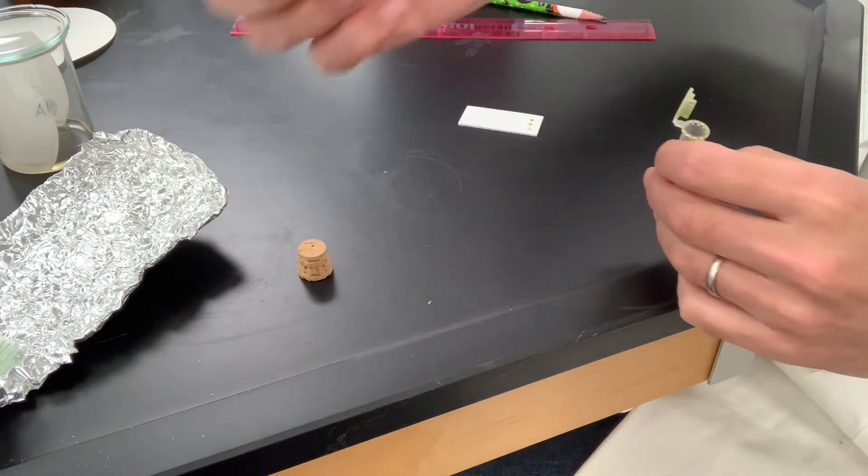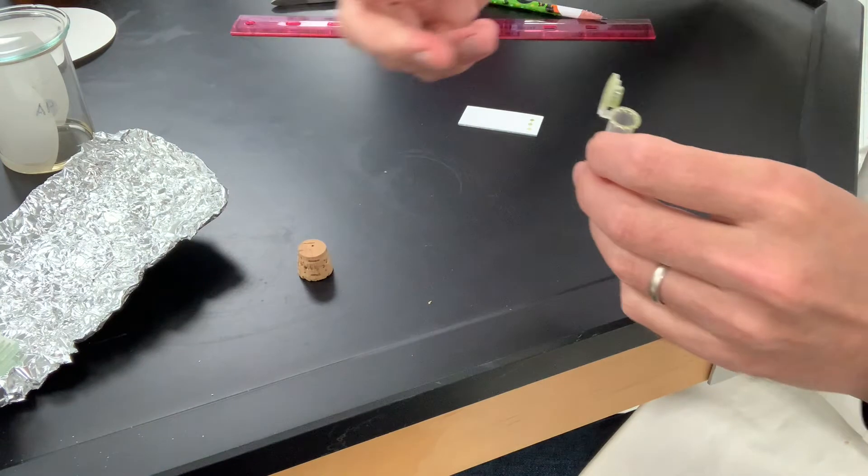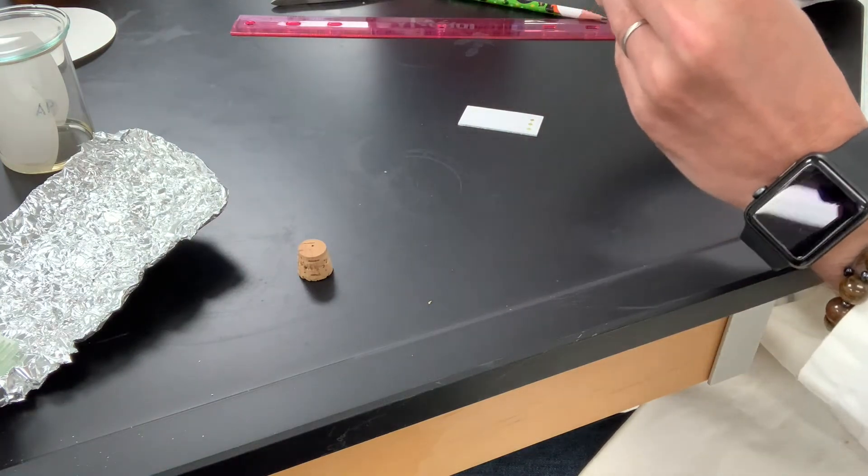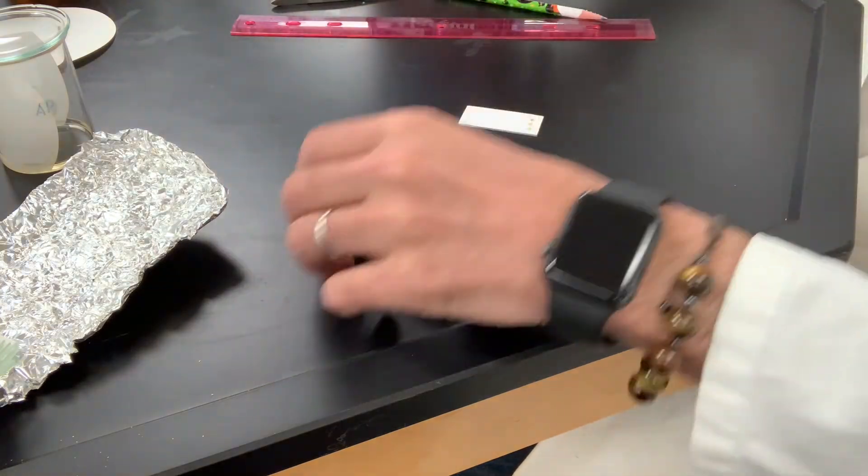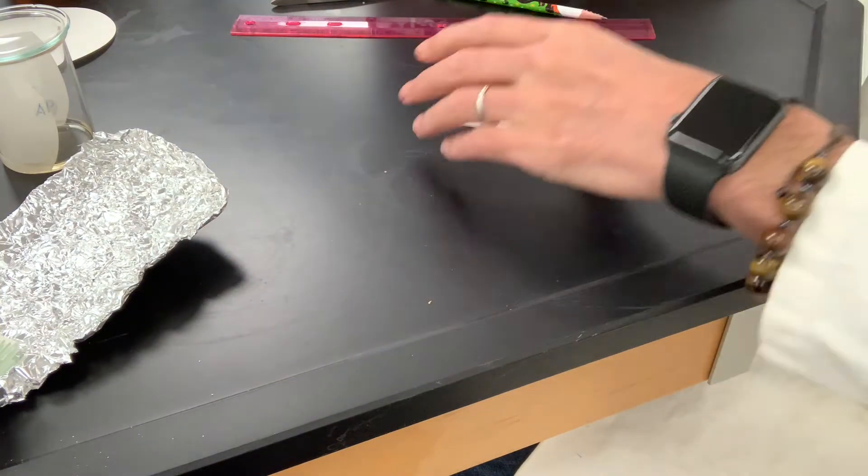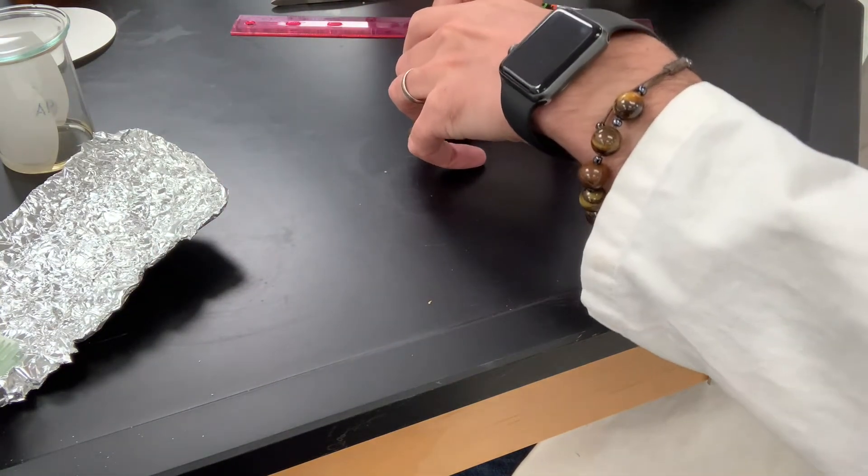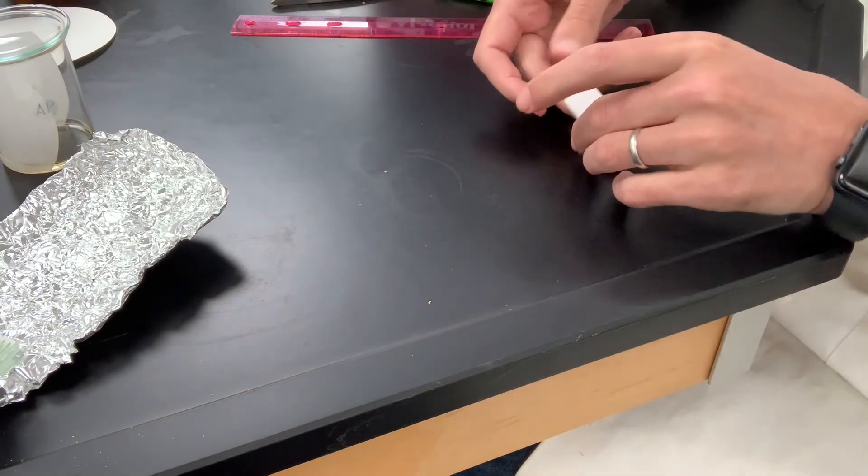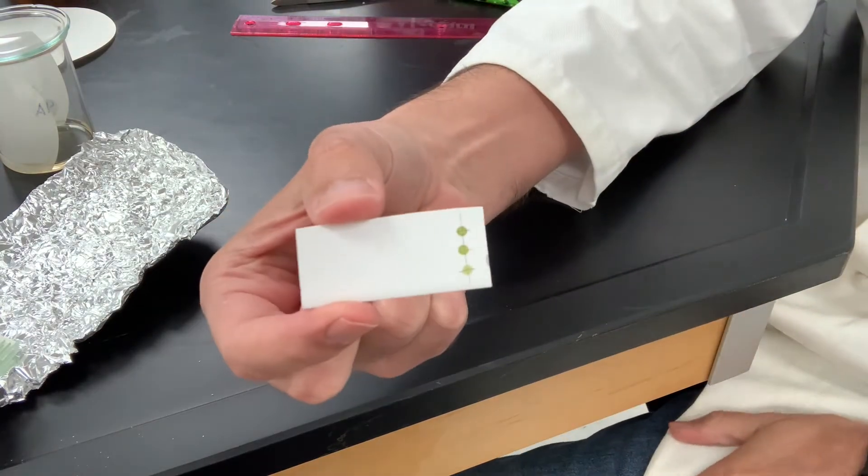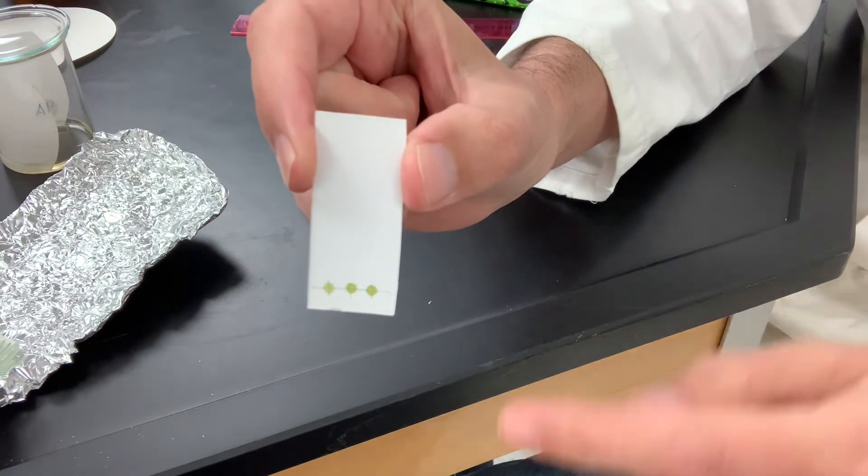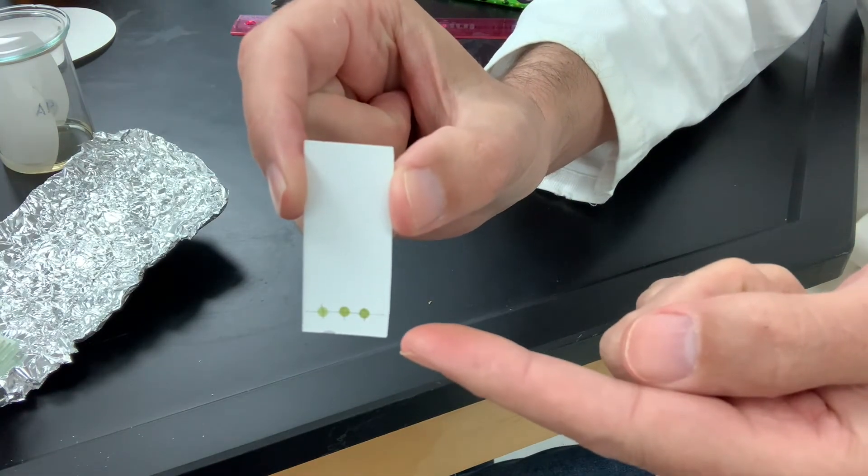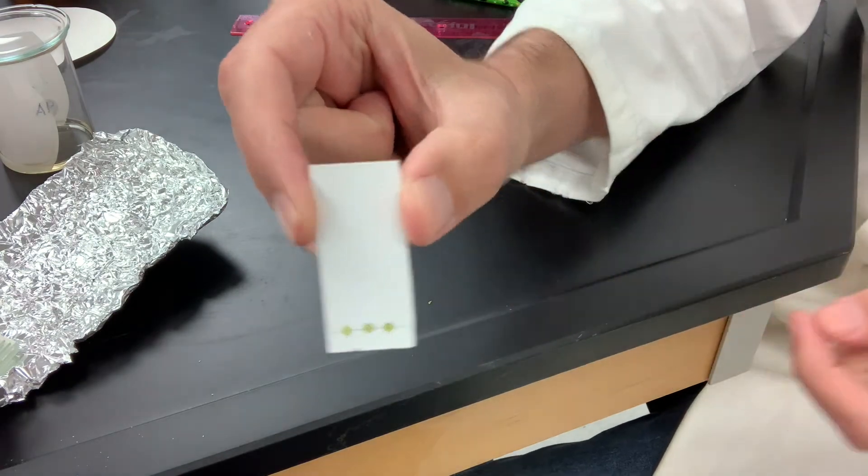All right. And this can be washed out with acetone and reused if you wanted to do that. I'm just going to leave it here in case I mess up and I have to do it again. So this is what our TLC plate looks like. We've got one spot, three spots, five spots. I'm going to place it into the solvent chamber and the liquid's going to go up, and then I'm going to draw a line.